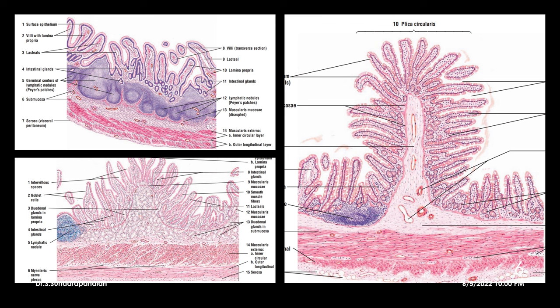If you see the jejunum slide, the submucosa has no glands — that is how we differentiate jejunum from duodenum. For ileum, you can clearly make out lymphatic nodules in the lamina propria — that is the striking feature. In the remaining layers, muscularis externa and serosa, the features are the same across all three. That is how we differentiate duodenum, jejunum, and ileum.